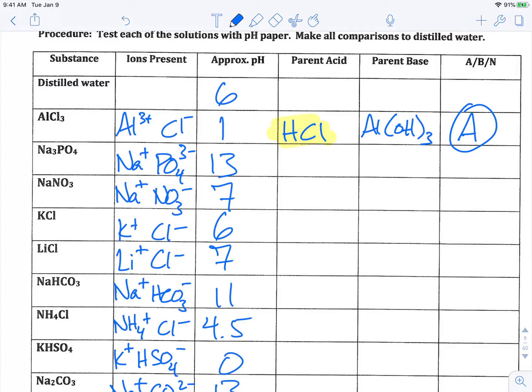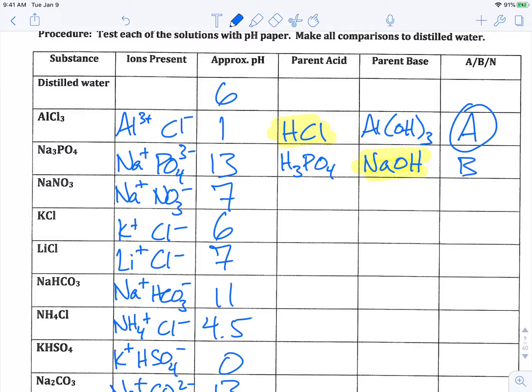This is a really simple way of understanding hydrolysis and predicting whether an ionic solution is going to be acidic, basic, or neutral. Looking at sodium phosphate, the sodium ion would come from sodium hydroxide as the parent base, and H₃PO₄ would be the parent acid. Of those two, sodium hydroxide is the strong one — phosphoric acid is not strong. Therefore, we expect the solution to be basic, which we see with a pH of 13.